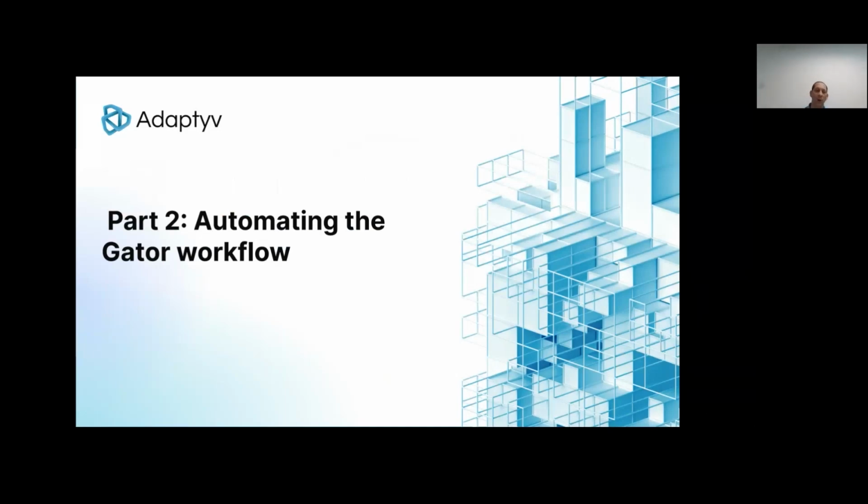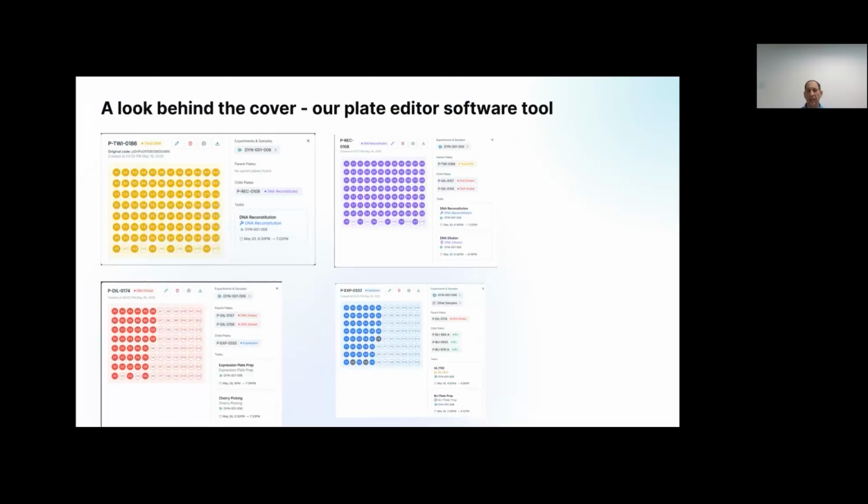And we add to our protein the Twin-Strep-tag in order to have an easy way to load them on the surface, with a tag that we can easily add in expression without need for an additional chemical modification. And the workflow starts with us designing a DNA, ordering the DNA, and the DNA arrives. In this case, on the top left, you see in our software tool how a plate of DNA looks like. And the DNA plate goes through several transformations.